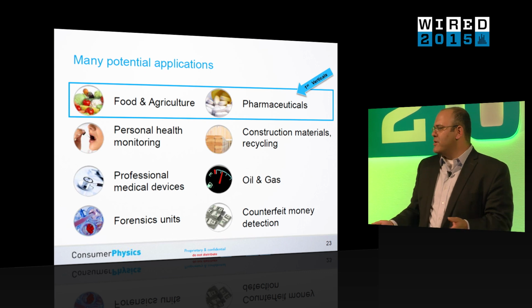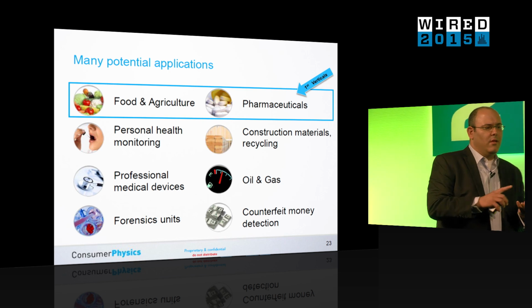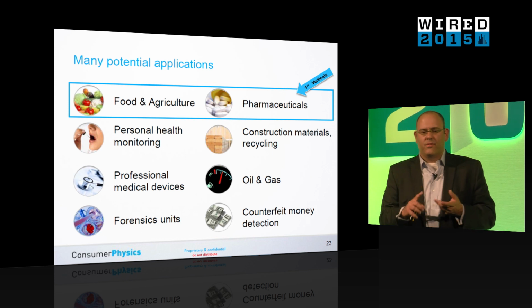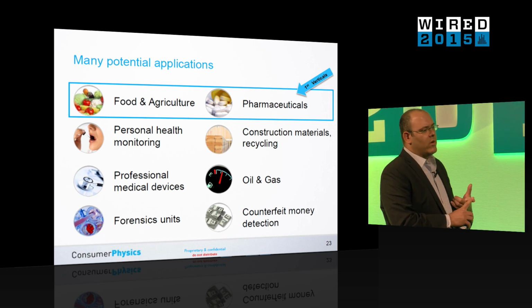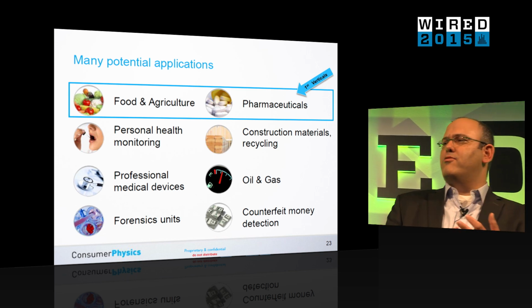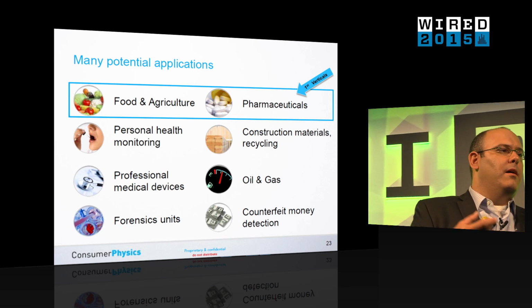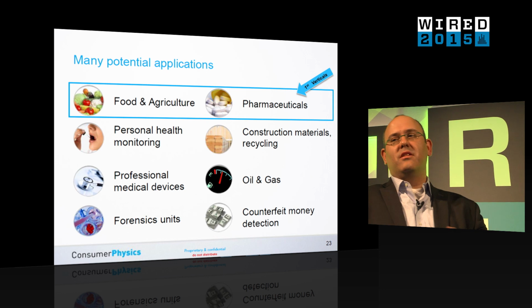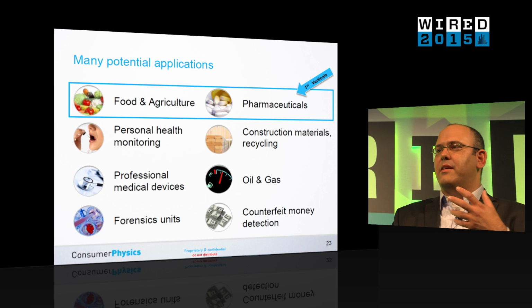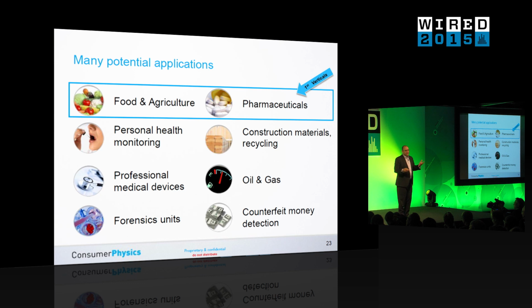But near-infrared spectroscopy is used every day in labs that have to do with agriculture, mineralogy, so gemstone analysis, forensic labs. Healthcare is another one of the big use cases for this technology. Oil and gas, petrochemicals, cosmetics, many diverse industries have emerged or are using this day in and day out, and have been discussing the application with us, and it sometimes feels like a daunting task. So how do we even approach this?